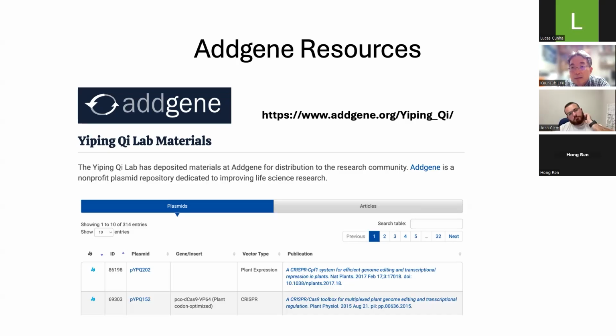Lucas, are you still... Actually, I have another question. Sorry if it's too many. But you mentioned that you did up to 16 gRNAs in your lab. That was quite impressive. And I was wondering, in those cases, what kind of strategies do you use to screen for plants that are edited for all of those sites and potentially homozygous for all of them? Because I imagine it's a lot of work.